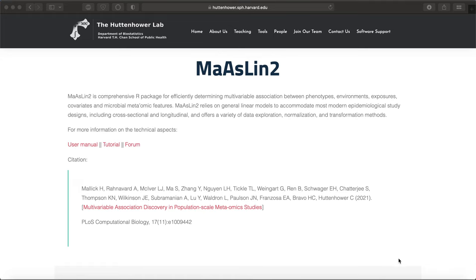So this is a brief introduction before we go ahead and get started in RStudio.